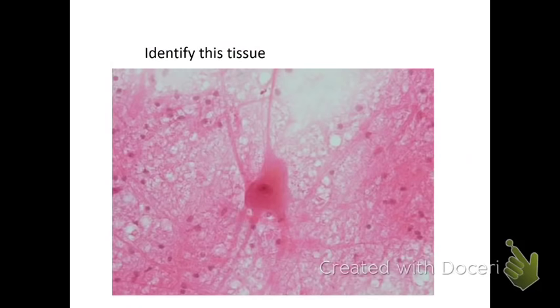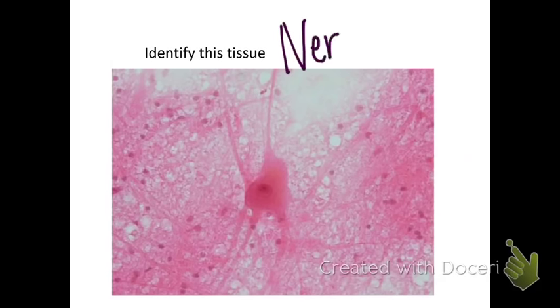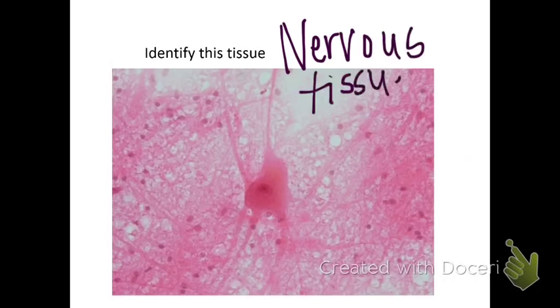This one should be easy — it doesn't look like the other ones. This is nervous tissue. You could actually say that one cell is a neuron.